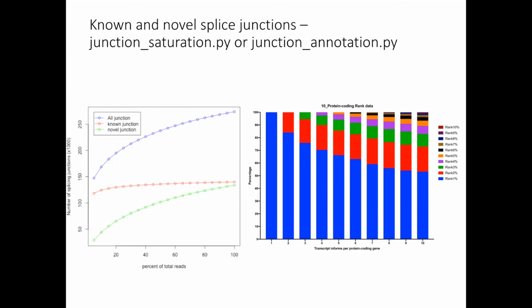The other thing you can do, of course, is to sequence deep to find new things. For me, and this is just my point of view, when you start to sequence deep, like in this case when you get above 20 or 25, most of the new things that you find are not functionally relevant anyway.